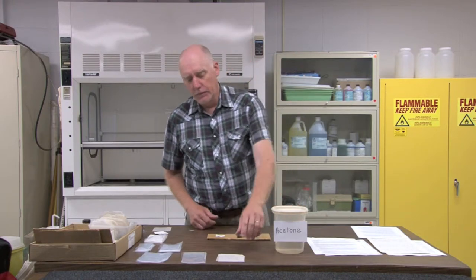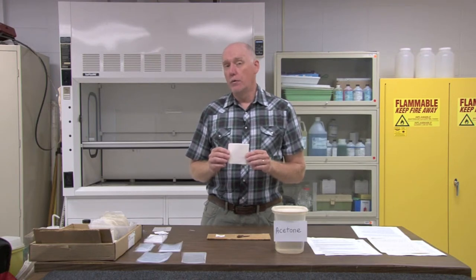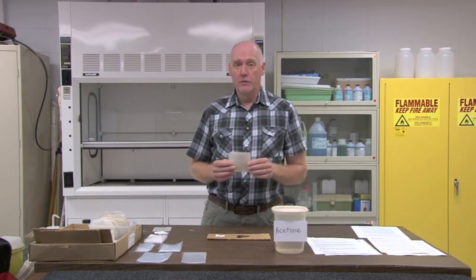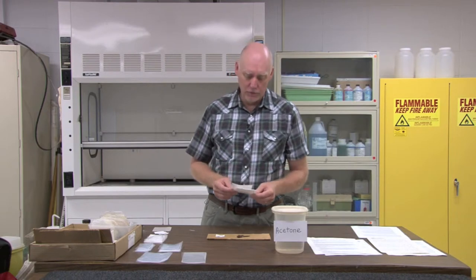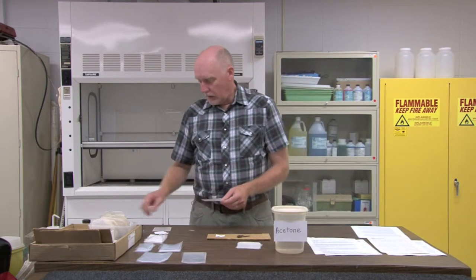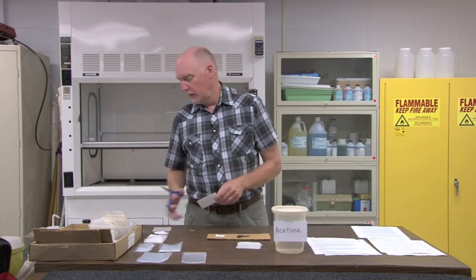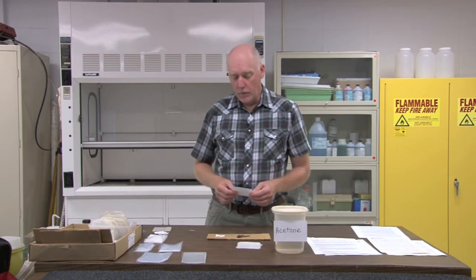You'll also need a variety of envelopes. I use glassine envelopes in the field that I purchase from BioQuip Products in California. These come in different sizes, so I buy a variety of sizes and use smaller ones for small specimens and larger ones for larger specimens. I also trim the corners of the envelopes in order to allow the acetone in and the air to come out more easily.